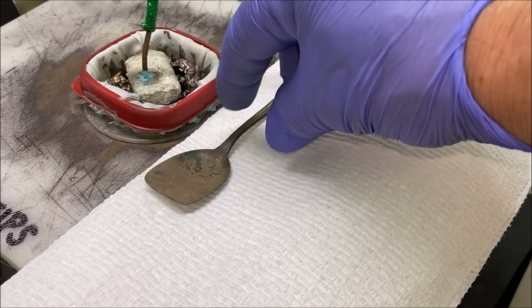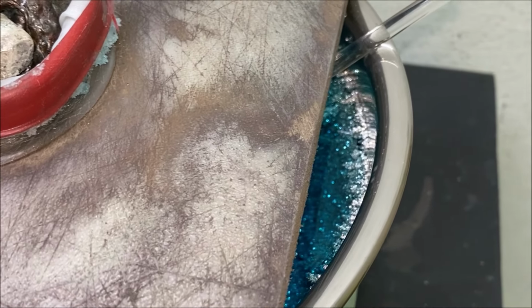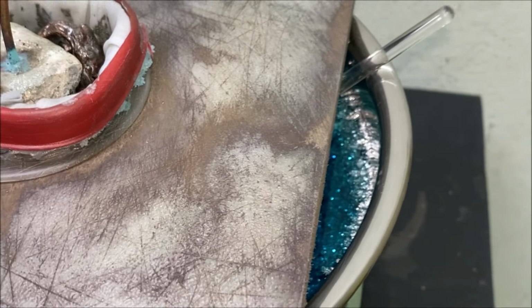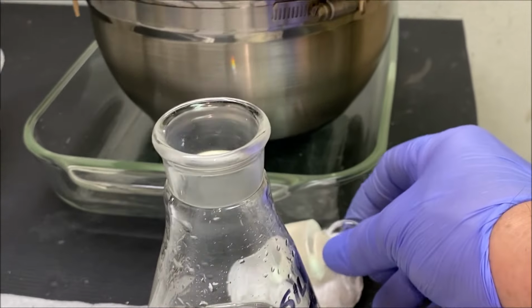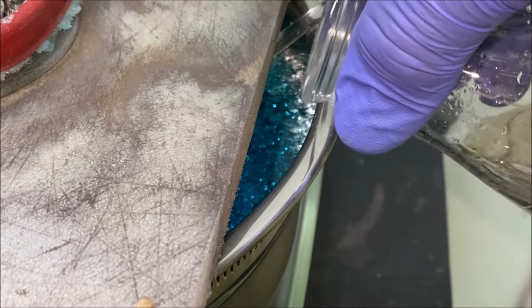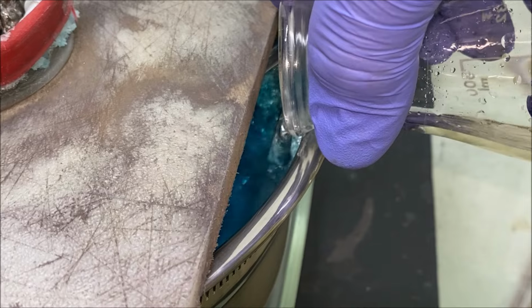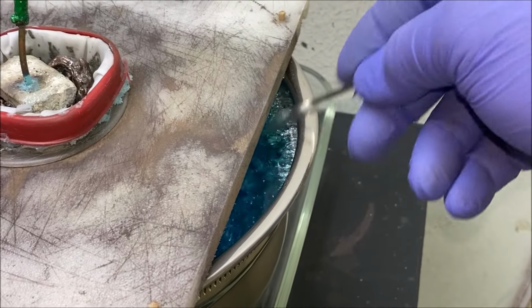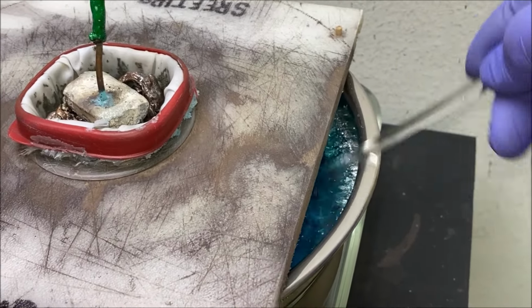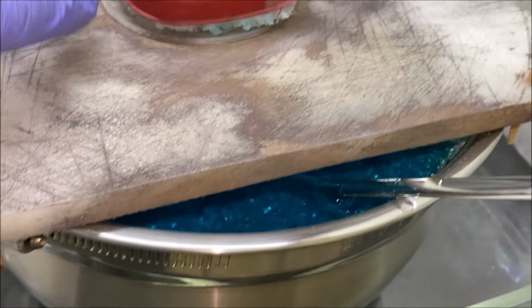Let's take a look at the electrolytic silver refining cell. It's been in operation for about 5 days. You can see the electrolyte level is getting a little low. So I've got some silver nitrate electrolyte here. I'm going to add a little bit of the electrolyte to bring the actual physical level back up, and this will also augment the silver concentration inside the cell. Let's lift this up and get a peek in here and see what this looks like.